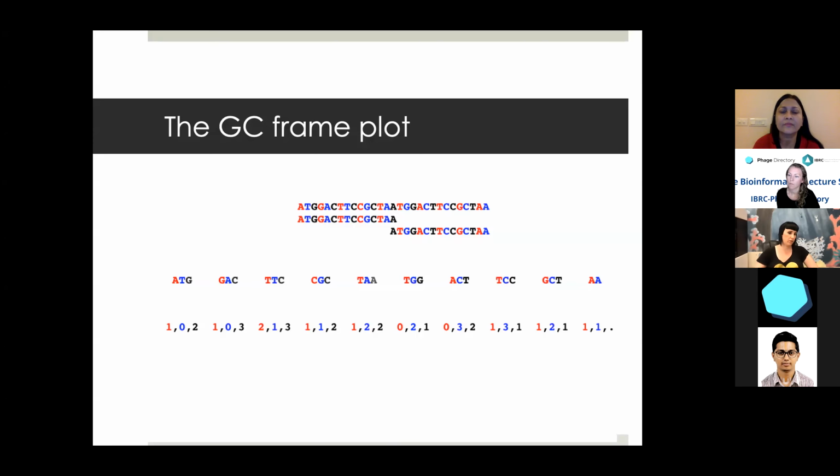And that's where PHANOTATE comes into its own, where you want to run PHANOTATE to automatically annotate a large set of phage genomes. And potentially, if you can, go through and review some of them to see how well they're doing. Artemis is very good to manually curate yourself, but you can't do it for large genomes or a large number of genomes.